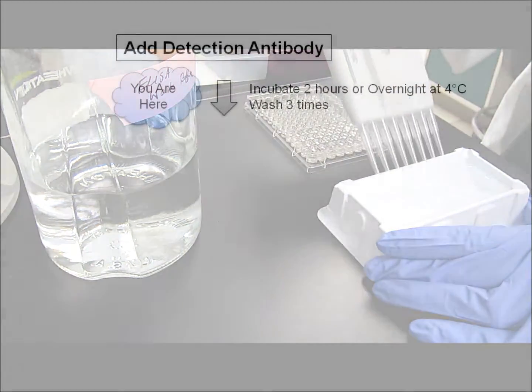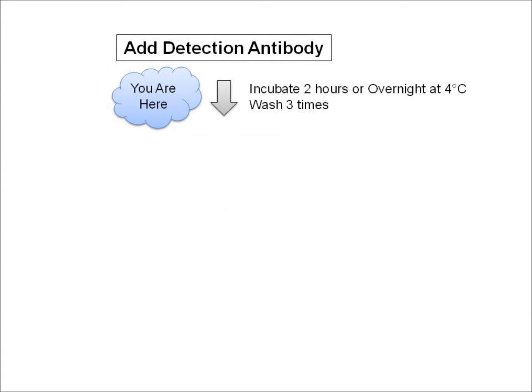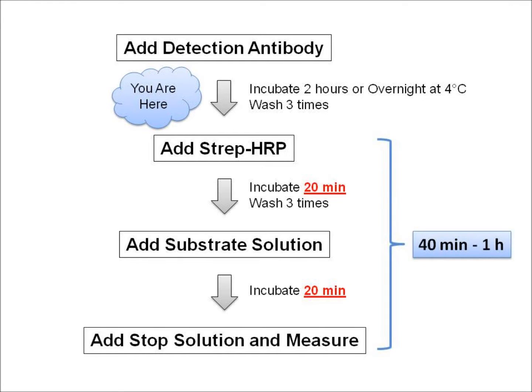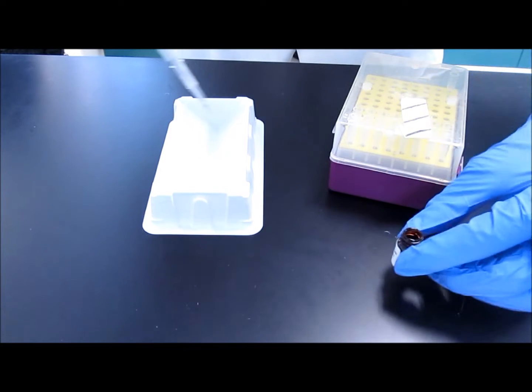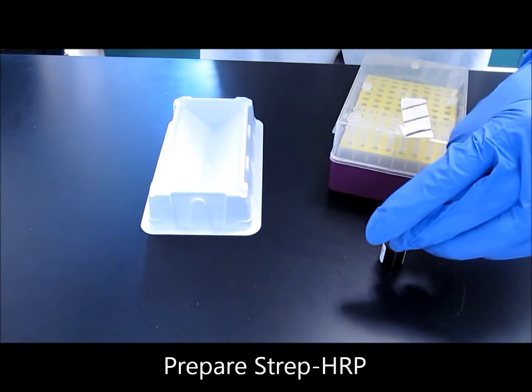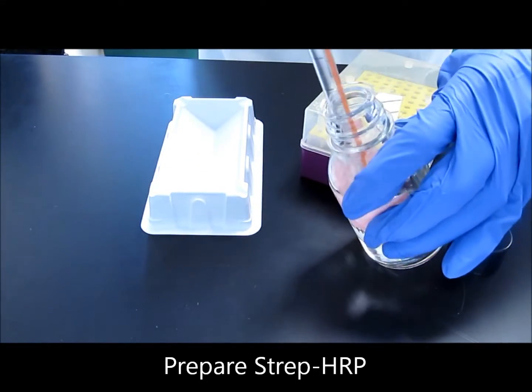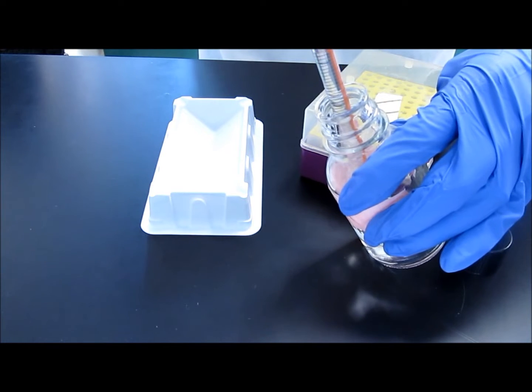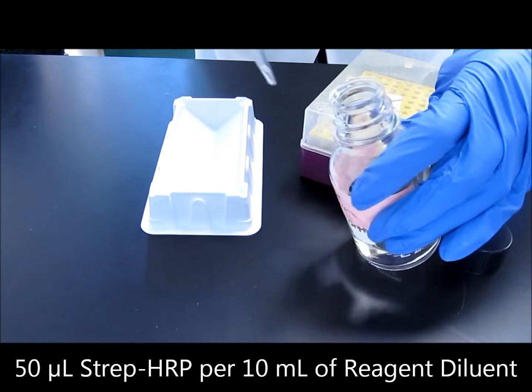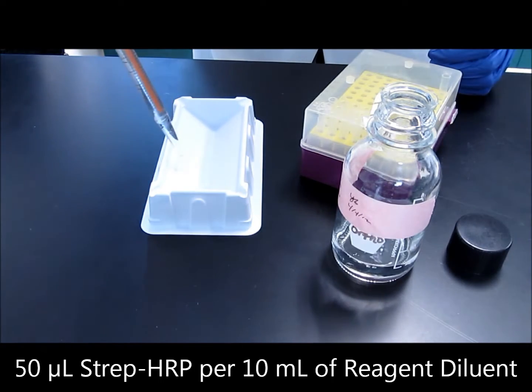Another thing to keep in mind is that from this point forward, the long incubation times are over and the assay is almost done, so be sure that your plate reader will be available for you in about 40 minutes to 1 hour. After the detection antibodies have been incubated, prepare the strep HRP by diluting it in reagent dilutant. For this kit, 50 microliters of strep HRP are to be diluted in 10 milliliters of reagent dilutant.